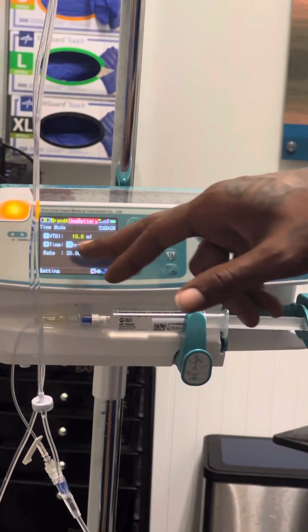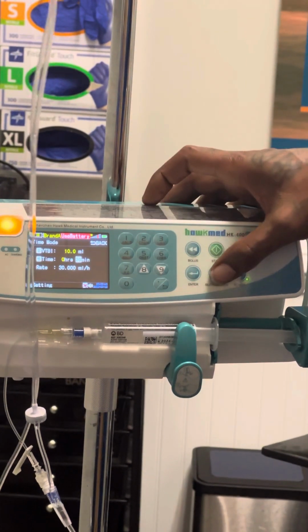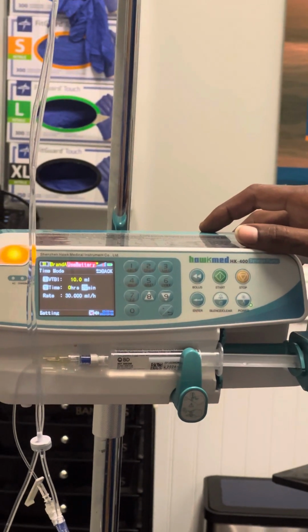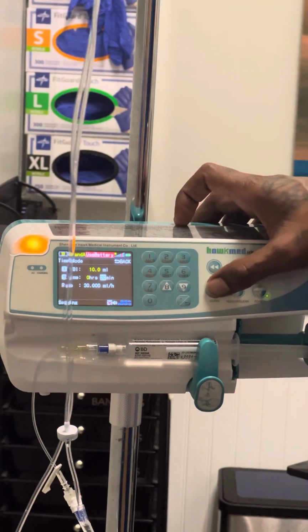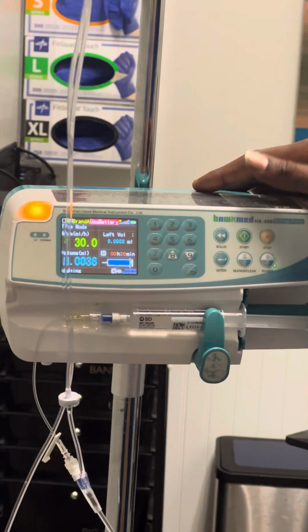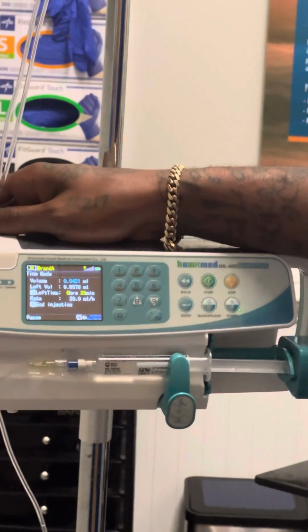So as you can see here, it's already set to 0 hours. I would hit enter. It's going to jump over to the minutes. It's already set for 20, but if I wanted to change that, I would just hit clear. And then I would enter the amount of time that I wanted to take for the entire syringe to be dispensed. Once you've got 20 in there, or the value that you've chosen, just hit enter again. Once you've done that, all you have to do is hit start, and it should start pumping, but I'm going to stop it. That's what it'll look like when you begin. And that's it.